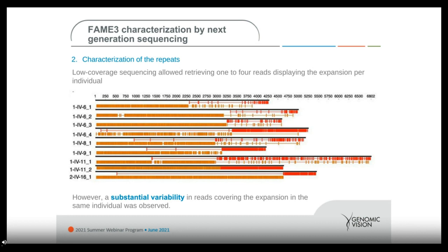Subsequently, once the scientists knew what was causing the onset of the disease, they decided to characterize the disease, and they focused on the use of long-range sequencing, where they could see within different patients the repeat expansions between healthy and unhealthy patients. But again, there was some limitation due to the fact that these are repeated sequences.